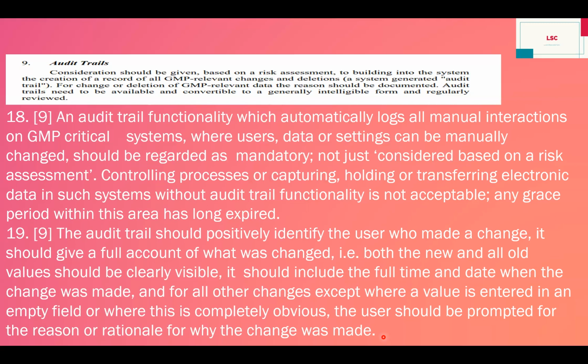And where we are going to fill in some remarks, for example in the case of chromatography, when we process and integrate in our system as a user, we simply write 'process', or we save the data. So the comment that we enter during our work, and that is captured in the audit trail somewhere in the data system, should be very clear.